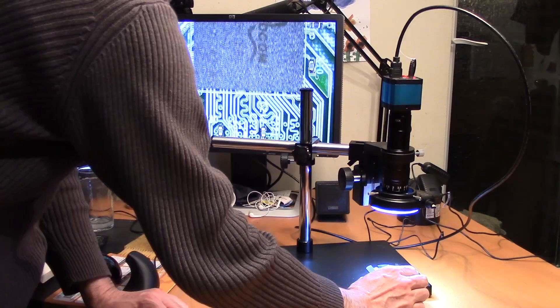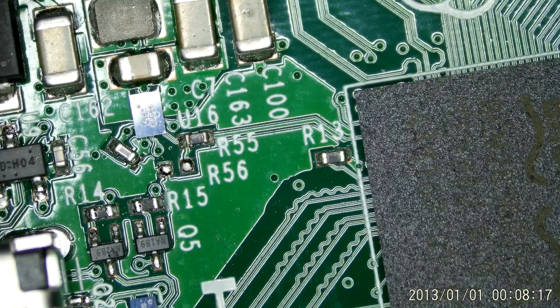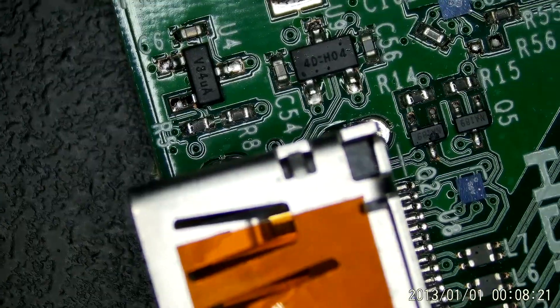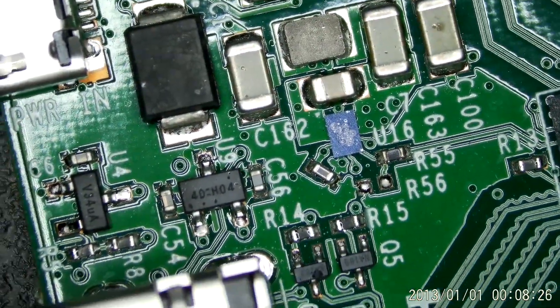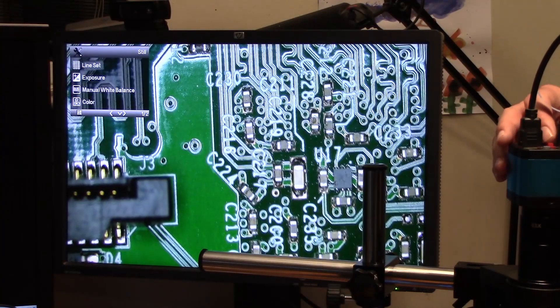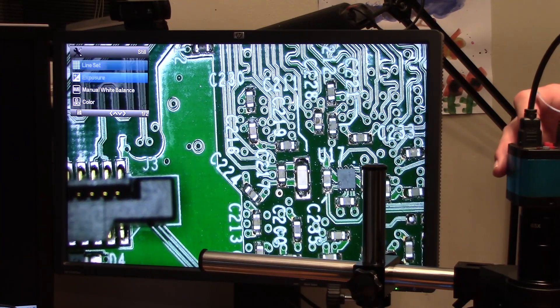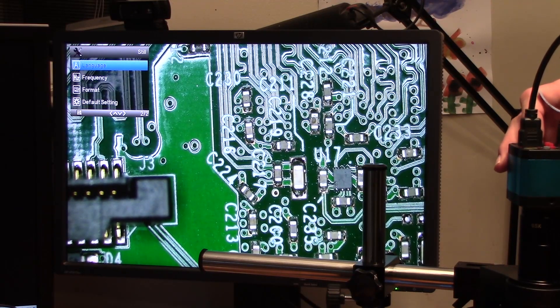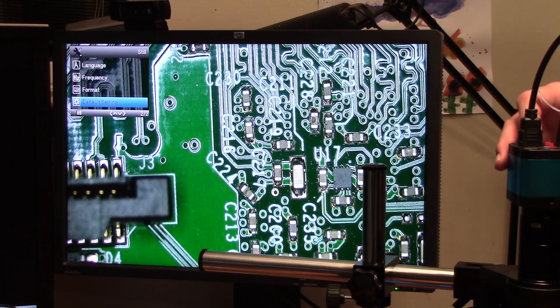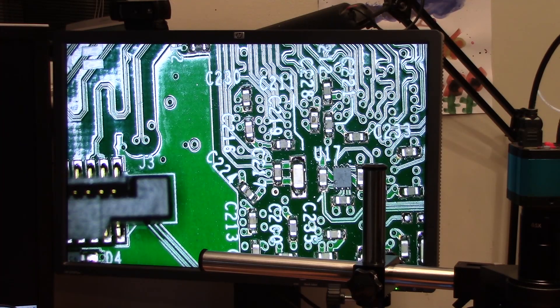That's looking pretty rubbish, actually. I'm not sure how the recording works, because I keep pressing record and I get a flashing red dot in the corner for a brief while. I don't know if the recording is limited to a certain amount of time, because this thing came without any form of instructions. Let me give you a quick look through the menus. We've got a line-set option that lets you put a horizontal, vertical line or crosshairs on the image. Exposure, white balance, colour, language. Frequency is 50Hz or 60Hz for flicker reduction. Format for the memory card, default settings for factory reset. Somehow there must be a way to set the time and date, because it puts a time and date stamp on recordings, but I haven't found it.